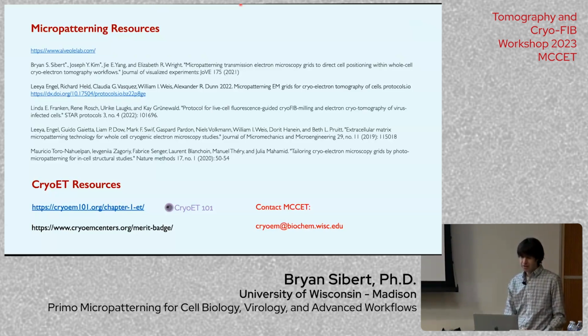And contamination. For eukaryotic cells, we have the standard antibiotic antifungals in our media. We're careful with all of this, but we don't do it in a hood up to adding the ECM, and we haven't seen contamination. If you had neurons or something where you're doing a longer cell incubation, I would be more careful. After patterning, you can rinse the grids in ethanol. After you do the patterning step, you can take them into the hood, rinse them in 70 or 75% ethanol or soak them, and then wash them in PBS and do the rest of the steps in the hood. I think that would be the best way to be sterile versus doing everything in a hood.